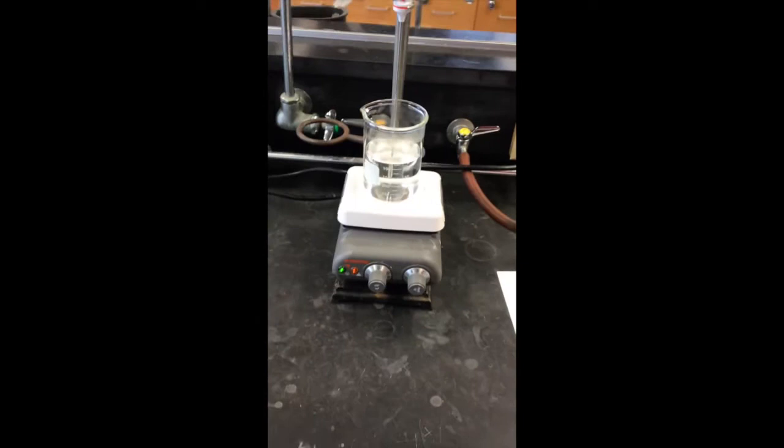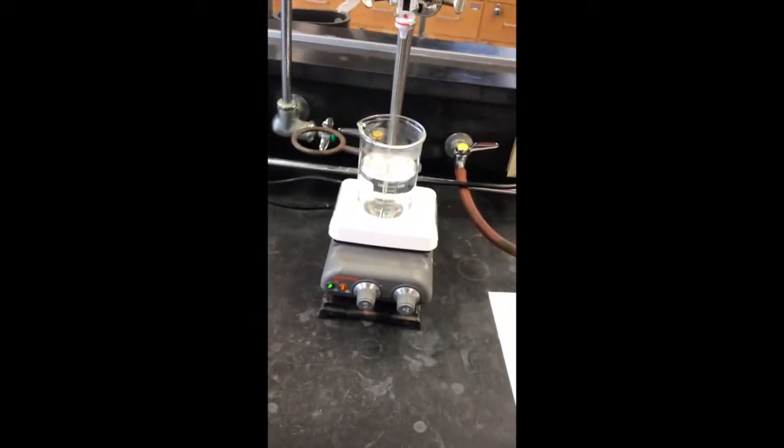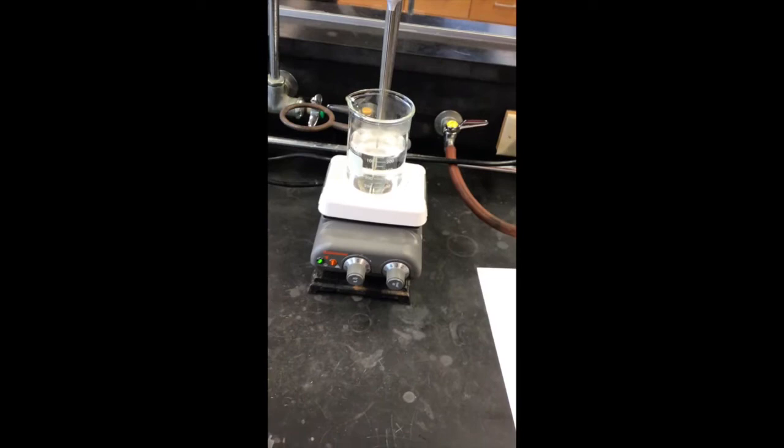If the reaction doesn't occur at room temperature and you want to increase the temperature, is it going to require a lot? If it requires a lot, then you're probably going to want to choose a solvent that has a high boiling point. So, for example, toluene is like a benzene ring with a methyl on it. That has a boiling point of 110 degrees. So if I wanted to heat the heck out of these, then I might choose that one. Okay, so not super polar though, so it's not an ideal reaction solvent for Sn2. But let's take a look at these ones and see what kind of precipitate we've got.